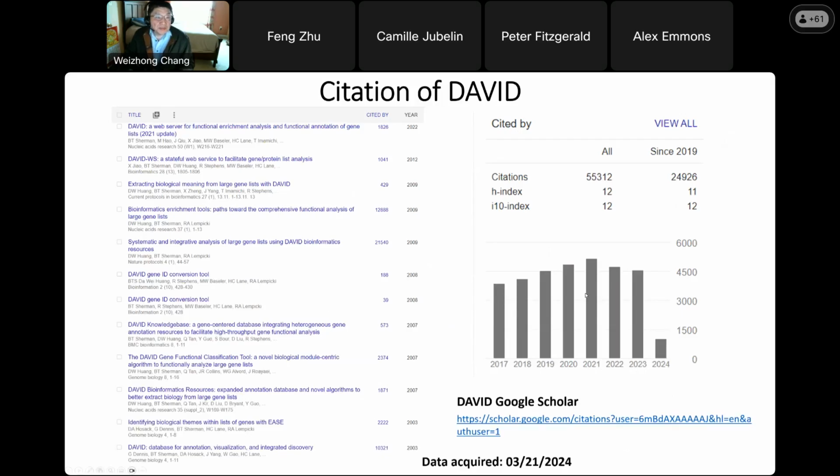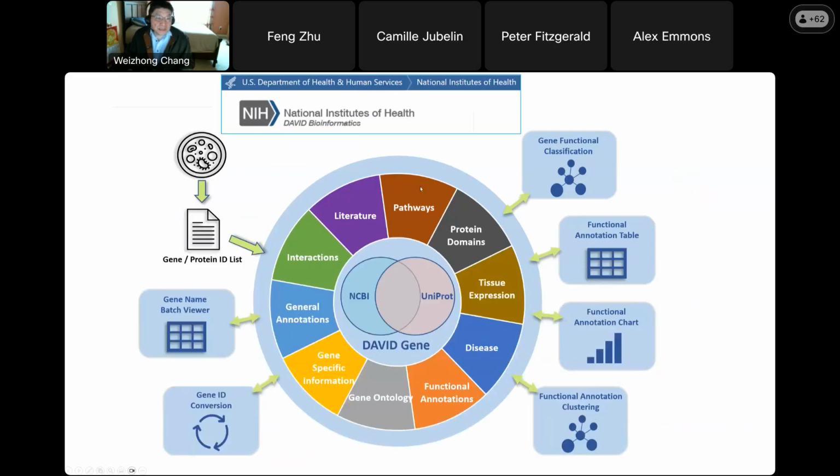DAVID is very popular in the scientific field. Since 2003, there are 11 papers published by our section related to DAVID. As of March 21st this year, we have more than 55,000 citations for these DAVID papers. DAVID consists of the knowledge base and also 6 tools. There are 2 utility tools, the Gene Batch Viewer and Gene ID Conversion.